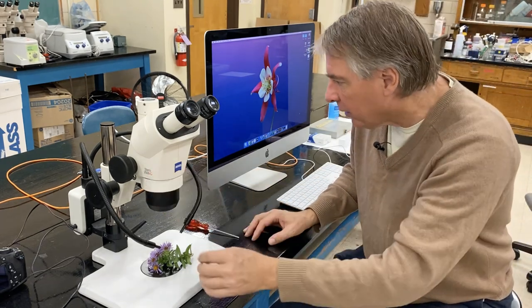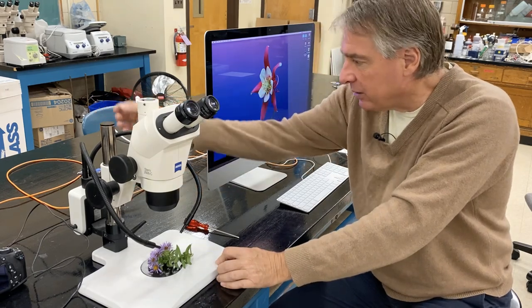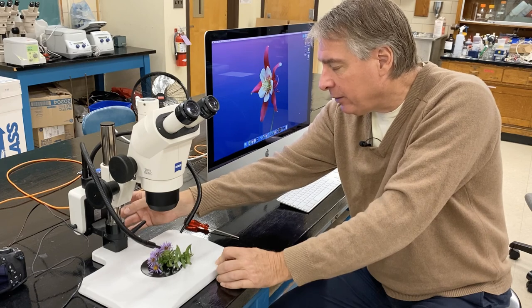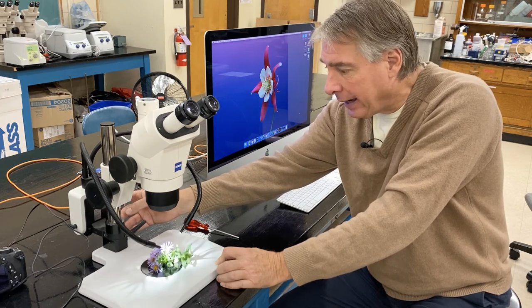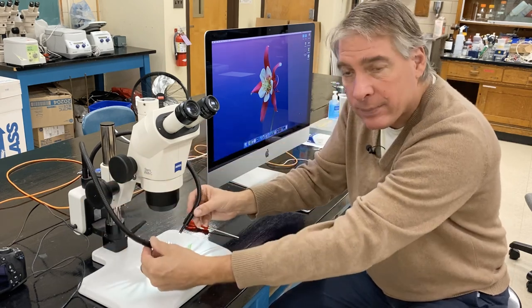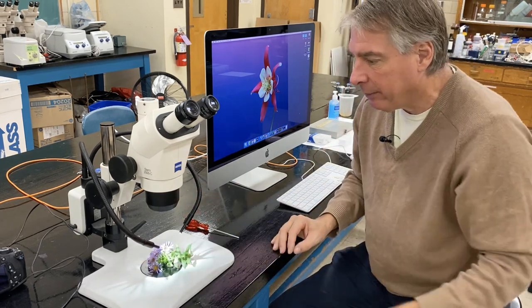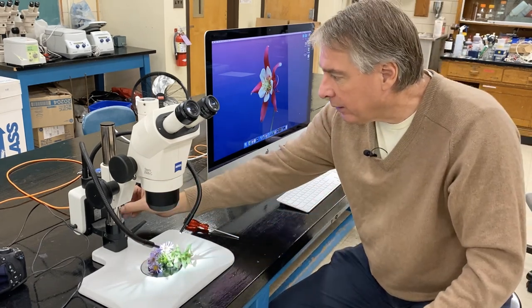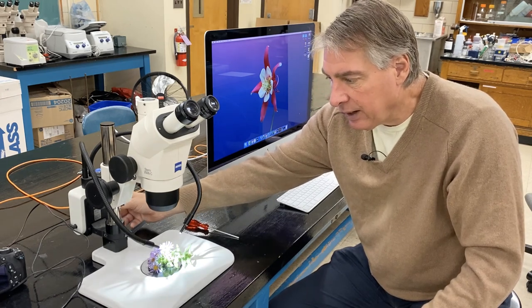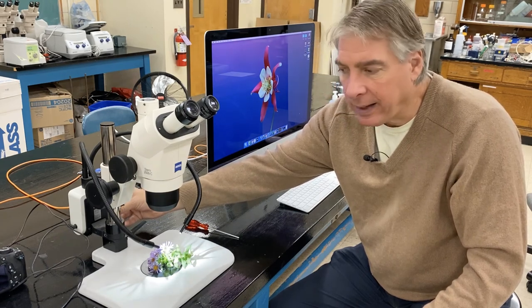The light source on this particular microscope is in the back, mounted to the stand. There's an on/off button on the right-hand side. I'm going to push that button on, and you can see that light comes out, illuminating this flower that I picked from our bio soil outside of the science building. There's also a knob to increase and decrease the brightness of the light on the subject matter.